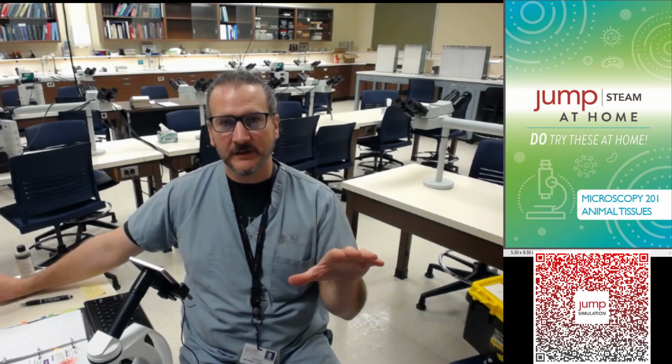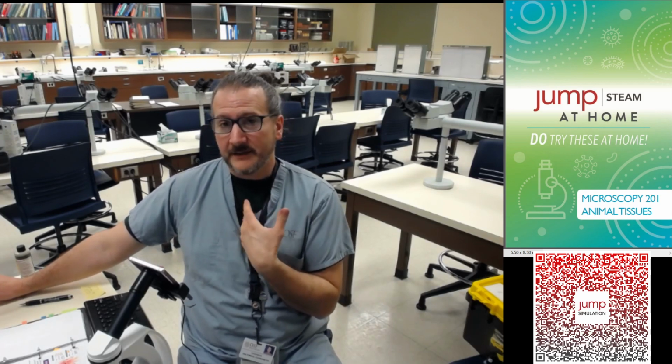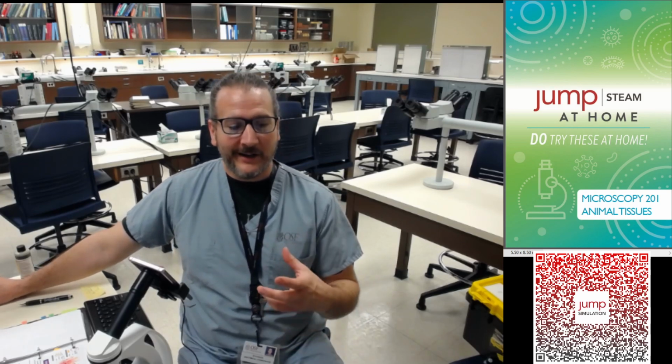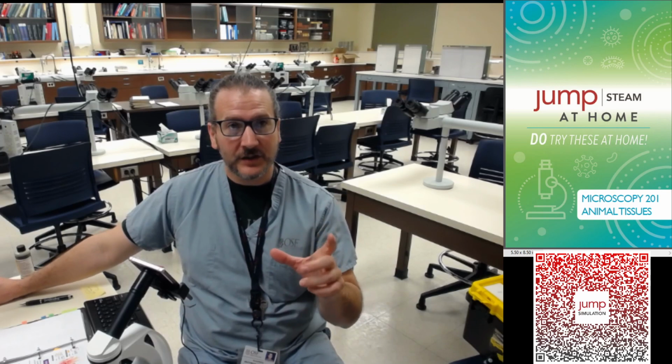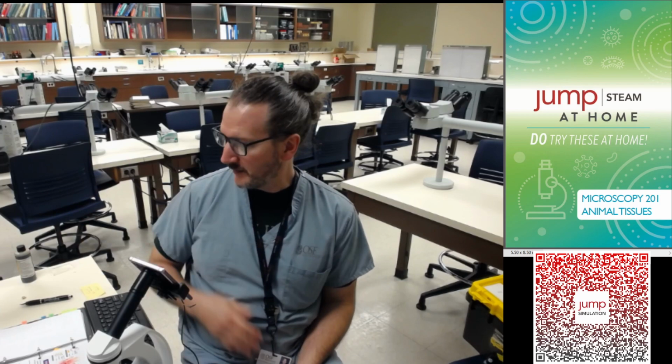So what's really cool is that when we look at these different types of tissues, collections of cells, if we're looking at us, or a dog, or a cat, or a bear, it doesn't matter because we're looking at very similar tissues. I always thought that histology of the tissues was a pretty fun thing to teach in college because it's very straightforward, and it's real easy to classify tissues, but people make it more complicated than it actually is. So we're going to try and make it as simple as possible. We're going to go to your manual.